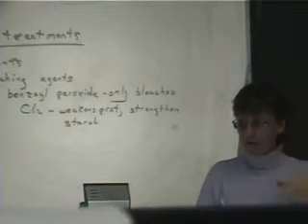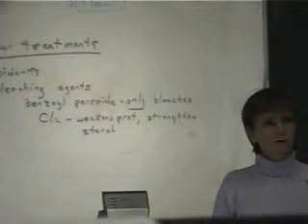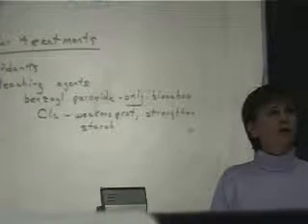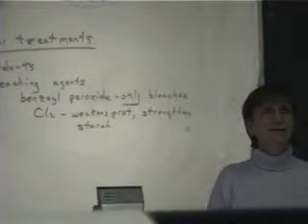And you get a pH drop, lower pH, which is an easy way to measure how the bleaching was done: measure the pH. So when you're testing unknown flours, if you think you have cake flour, I'd be running pH and TTAs.